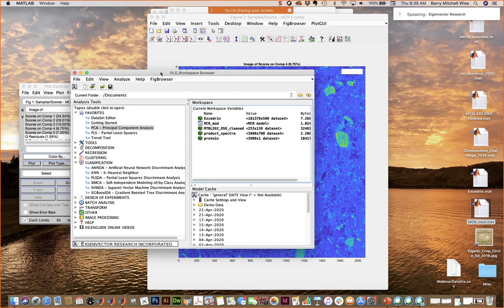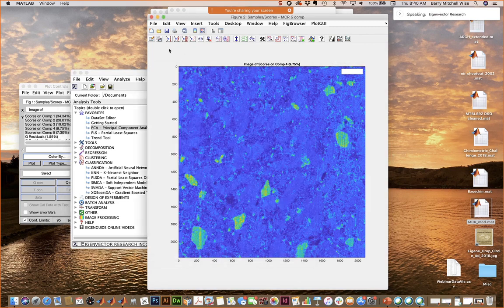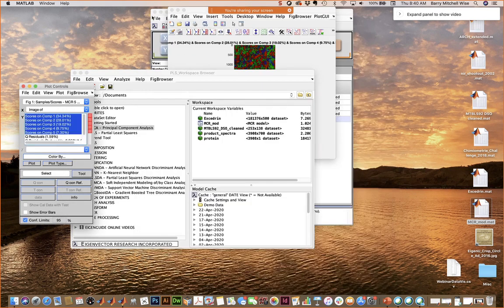I'm not an expert in the search bar. That would be a Bob thing. Bob's really an expert in regular expressions and the search bar. So if you search for search bar, you'll see how that functionality works, and that might be able to help you with that.